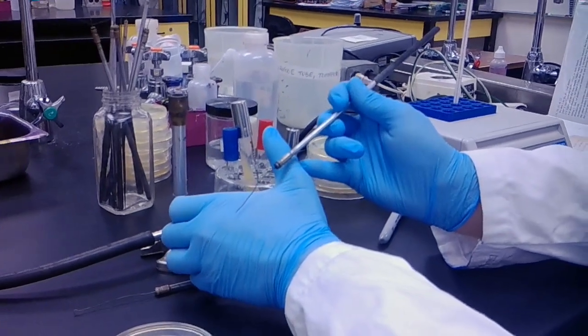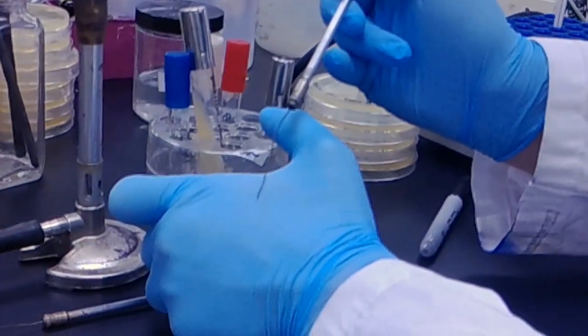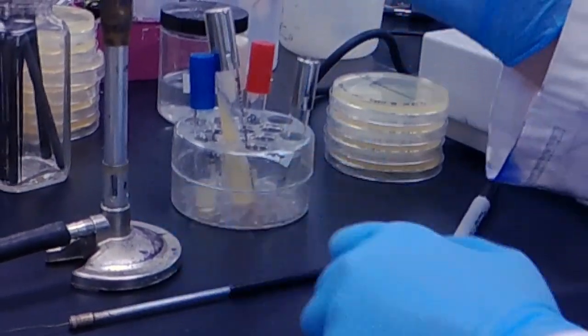As you can see, this doesn't actually have a loop here. This is what I'm going to be using for collecting my bacteria from the slant.